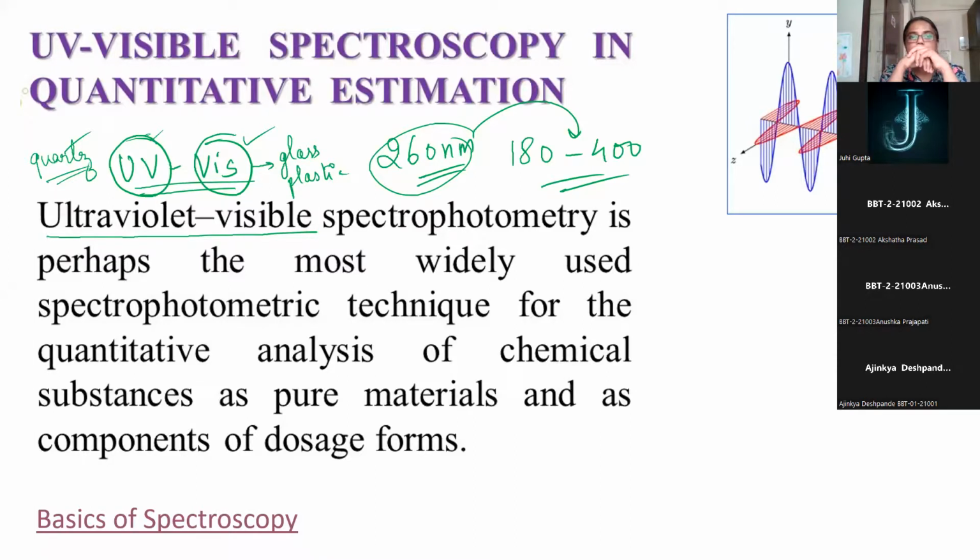Now let's discuss emission. When the atoms or molecules present in the matter jump from excited state to the ground state, they release electromagnetic radiation. This is called emission. So basically, when any form of energy falls on the electron, whether it is light energy or sound energy, if the electron absorbs energy, its kinetic energy is going to increase, and from a ground state, it will go to an excited state.